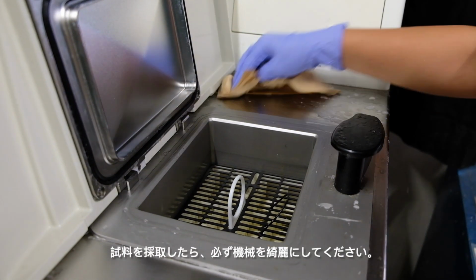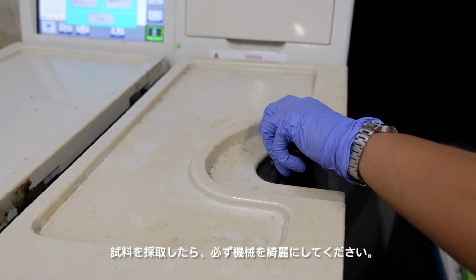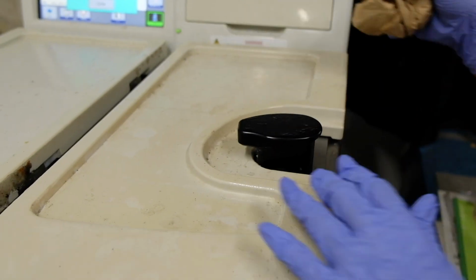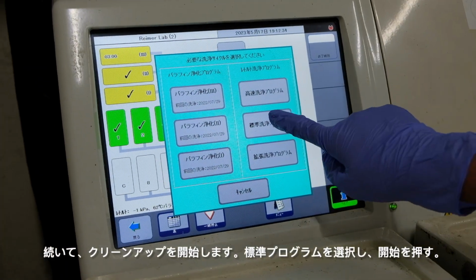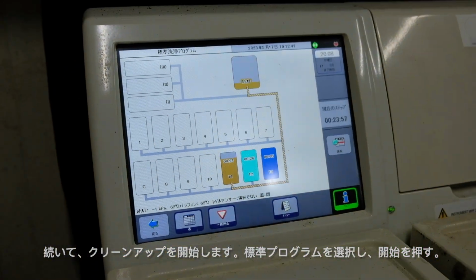Once you've taken your samples, make sure to clean up the machine so we can finish this part up. Once you finish cleaning the machine, we'll start up the cleanup setting, where we will select the standard program, press OK, and it'll start.